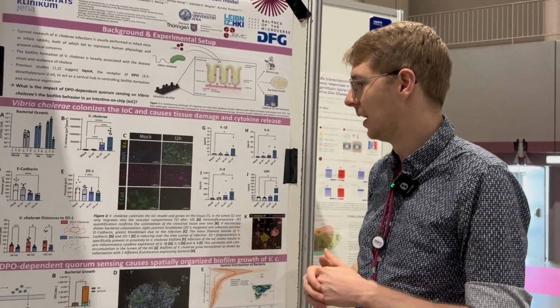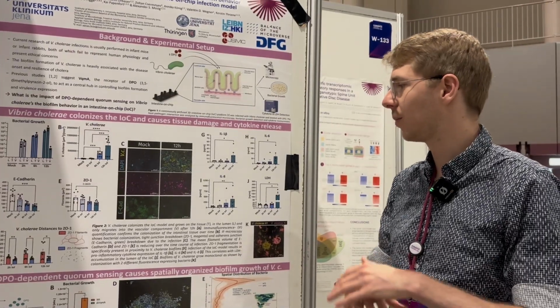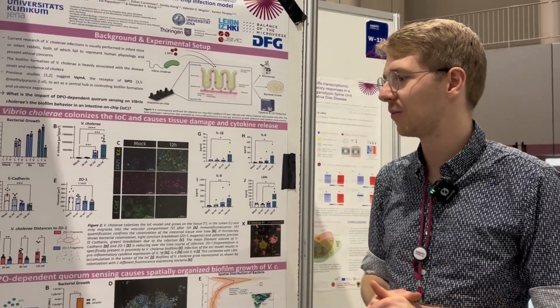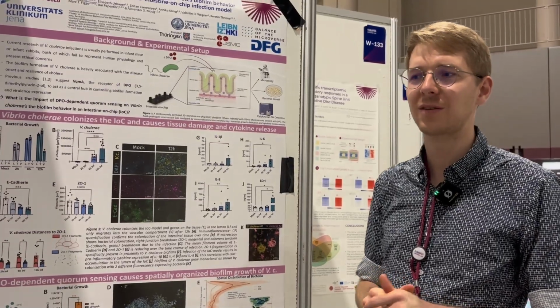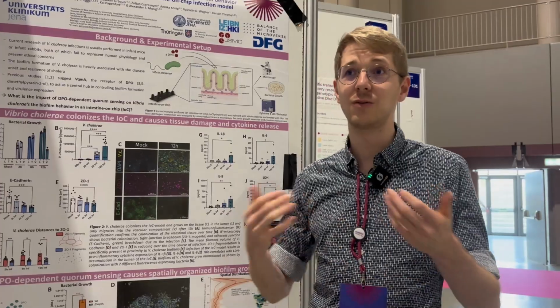So this is really cool, and it shows how this quorum sensing really seems to have a major impact on how the bacteria behave in the chip. And hopefully, this gives us more insights in how the bacteria are responding and living inside us humans, but also inside of the environment.